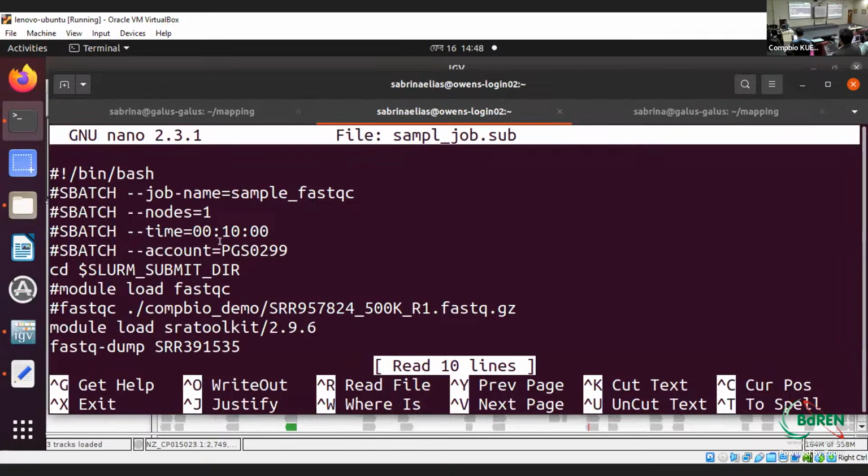There is this kind of format, right? You already are very used to this. So here in the job name, we can just write whatever, it's for our reference. It's not for anything else. We can write that it's alignment.